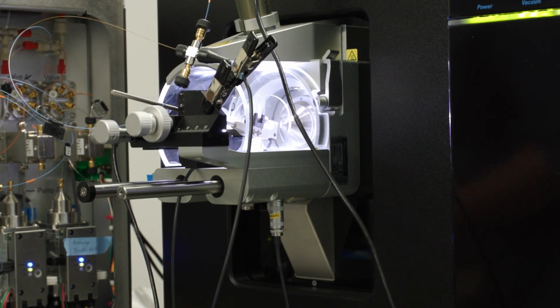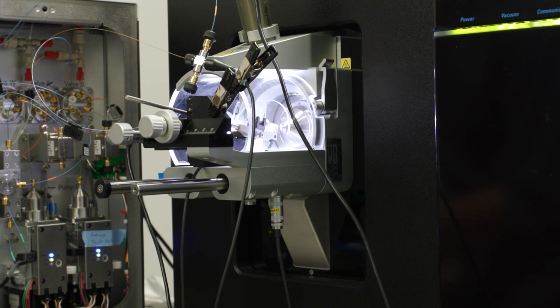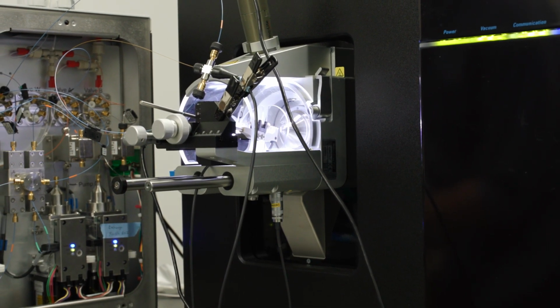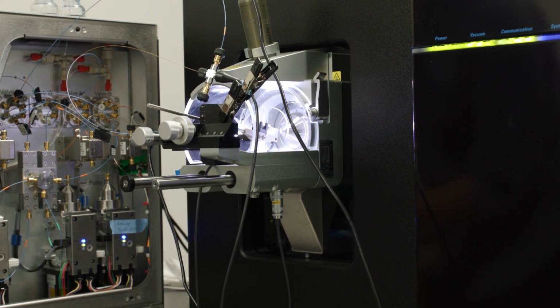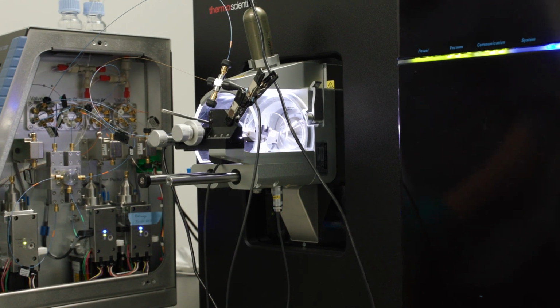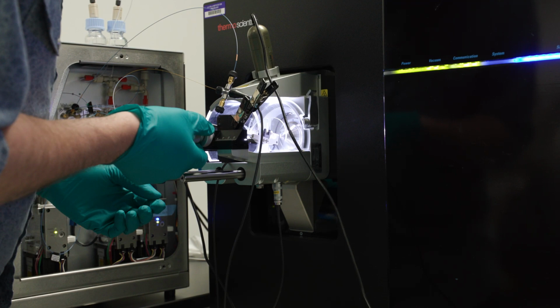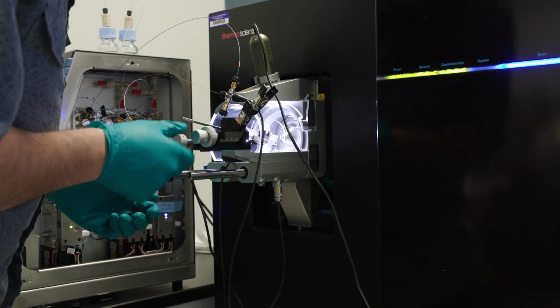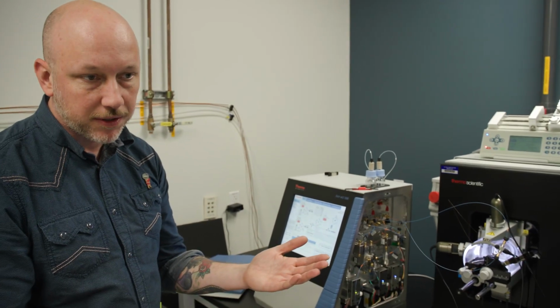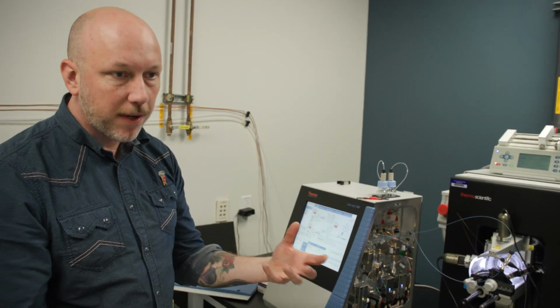In fact, I can only think of a couple labs that are mass spectrometry-based proteomics labs that are mostly emphasizing immunology. And I think historically that's just because the sensitivity of mass spectrometry hasn't been great. But in the last couple of years, it's really gotten to a point where we can do a lot more and we can ask a lot of different questions that we weren't able to ask in the past. And immunologists especially are the types of scientists where they care about the mRNA levels and how the mRNA levels translate to protein levels. And those don't always match, especially in a lot of immune system models that we have. And so it's really important that we can do this.